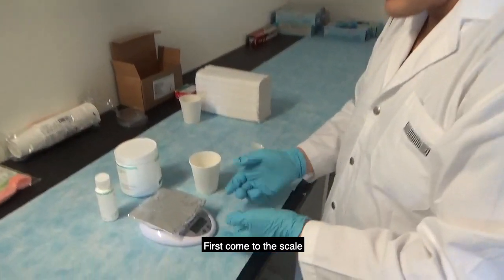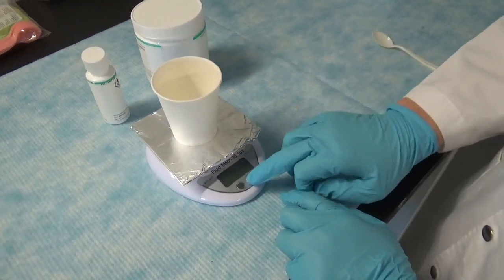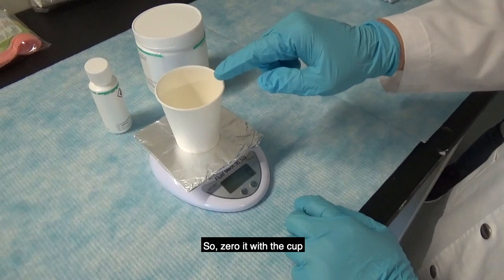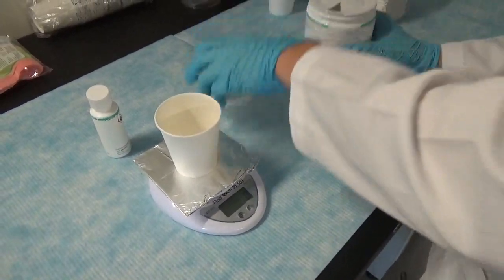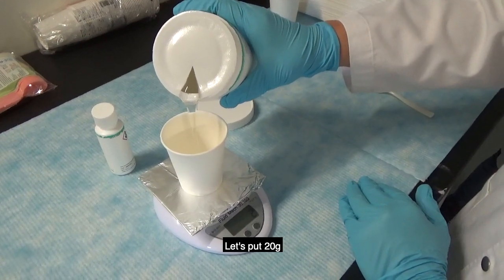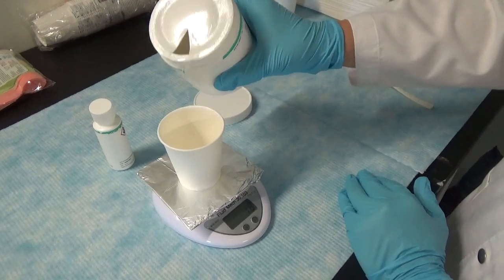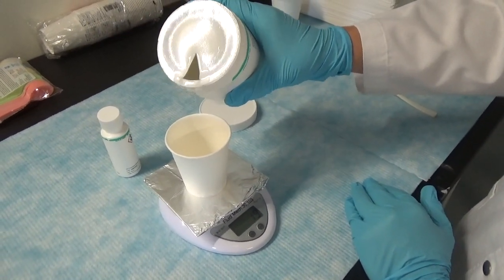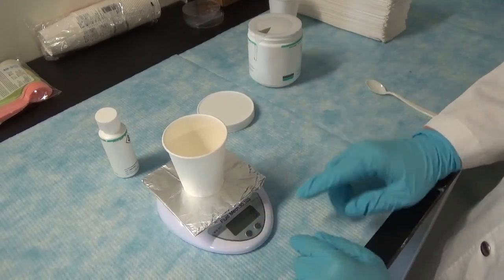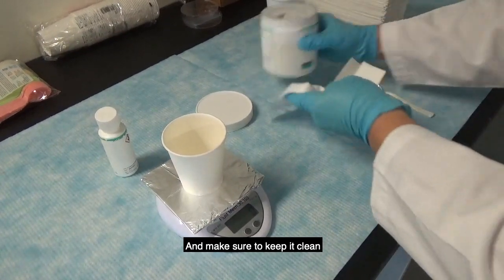Come to the scale, place the cup, and turn it on. Zero it with the cup. Put in the base — let's put about 20 grams. Once that's good, zero the scale again and make sure to keep it clean.